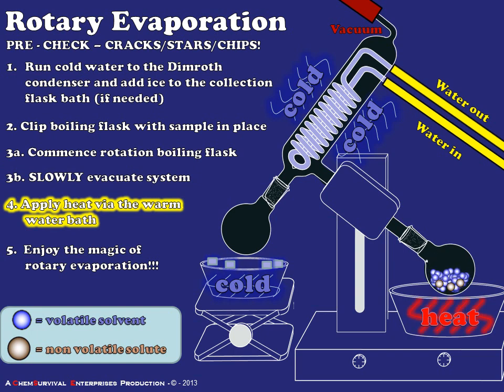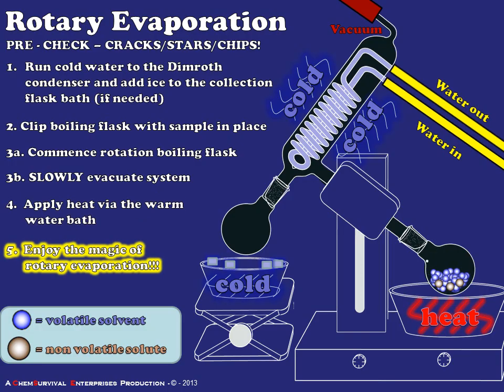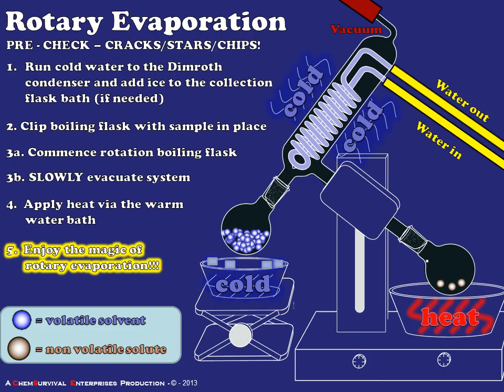Finally, we're going to apply heat to that round bottom flask. So now we have our sample being agitated to prevent bumping, drawn onto the walls of the flask to encourage evaporation, evacuated to encourage evaporation, and being heated to encourage evaporation — we've done everything possible to get all the volatile material into the vapor phase. As you can see, the volatile solvent materials are vaporizing, moving up the stem, condensing on the Dimroth condenser, and the liquid drains into the solvent trap until we've exhausted all the solvent from our sample. At this point, I've successfully isolated the volatile material from the non-volatile material in my solution.